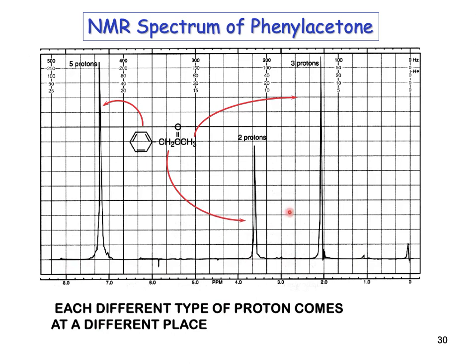So what are these lines? These are the frequencies of these protons: the frequency of the methyl, the frequency of the CH2 which is methylene, and the frequency of the phenyl protons. The NMR spectrum tells us the frequencies of the different types of protons present in a molecule.